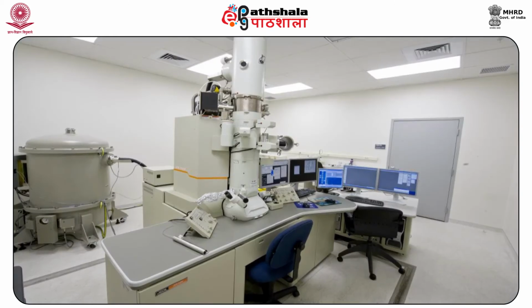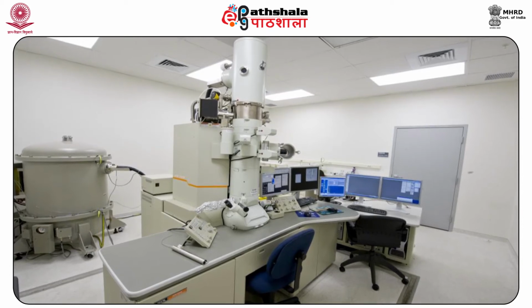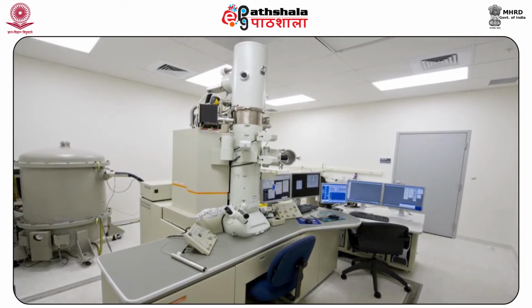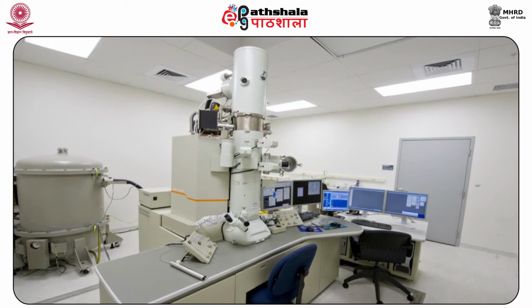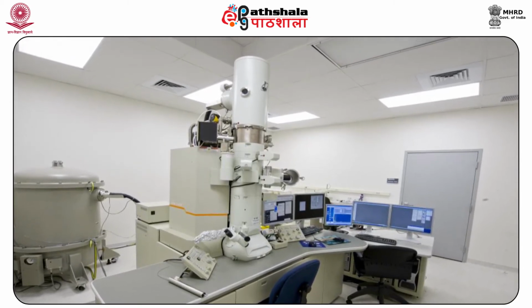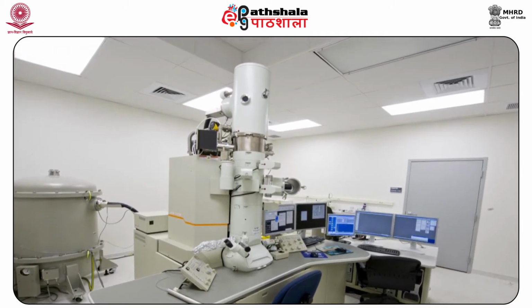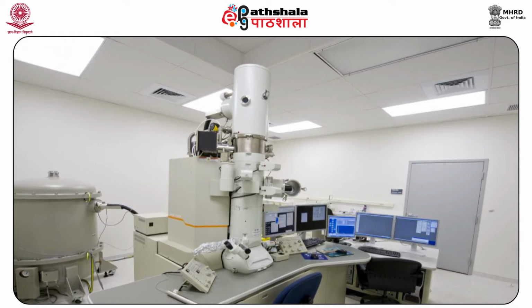In the TEM, an electron beam is passed through an extremely thin section of specimen and a 2D cross section of specimen is obtained. SEM, in contrast, visualizes the surface or structure of the specimen, providing a 3D impression.